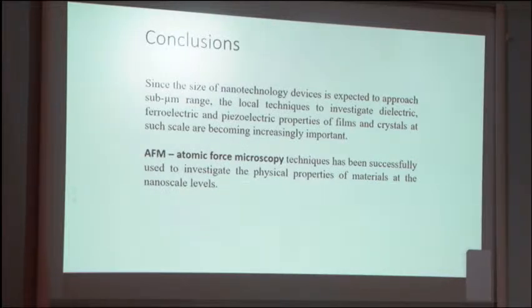Okay, conclusion. I don't show all results, this is impossible, but atomic force microscopy is a very useful method for investigating physical parameters, physical properties of nanomaterials and organic materials too. Thank you very much for your attention.